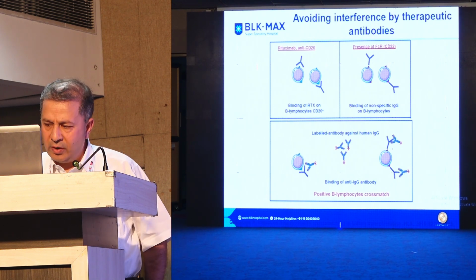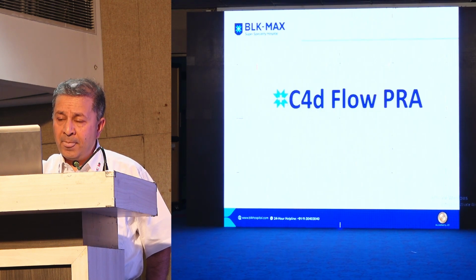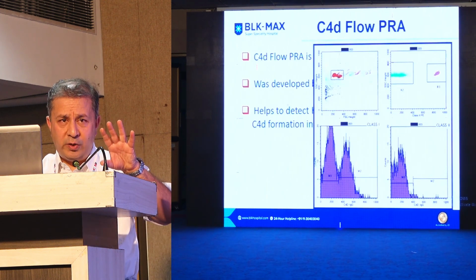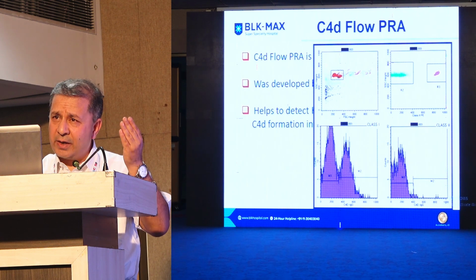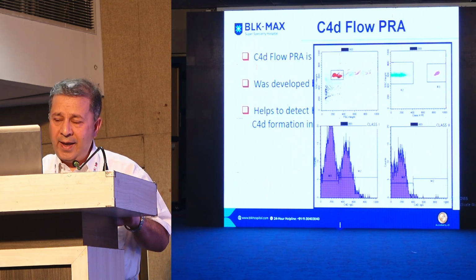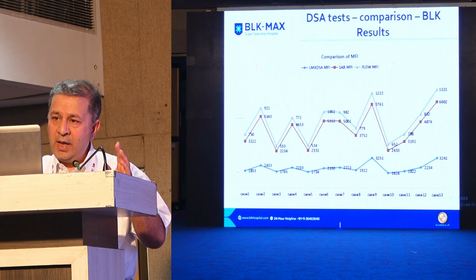So this assay has already been developed very well by most of the people. We have also started doing it in our center. C4D, again, something which was talked about a little earlier, can also be done on capture beads, using beads which already have a capture antibody that picks up the C4D from the serum of the patient, and then can be done on flow cytometer. And the same thing is actually done by a Luminex also.